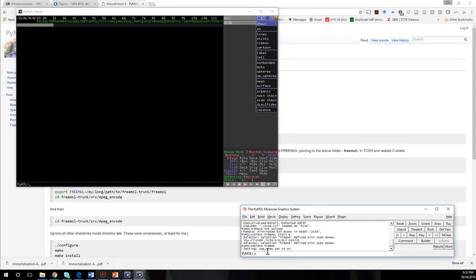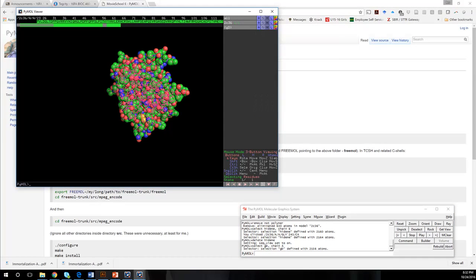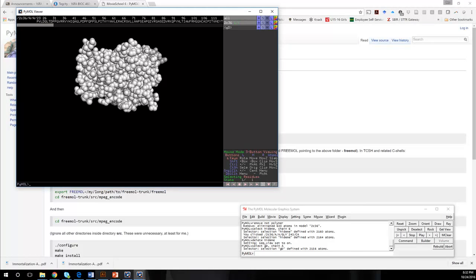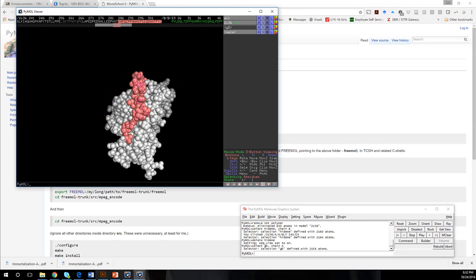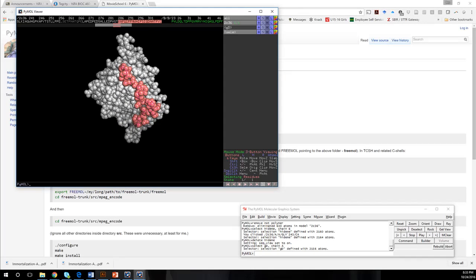You know what I didn't do? This is what I should have done. Okay. Then I will just do this. Okay. Then I will change the color, take off the selection, and then I am going to color about 285 through 306, just so that I have a frame of reference, because that's what I use a lot of. So I'm going to make it deep salmon, and then I know where that's at, and I have a frame of reference to what I'm looking at, because otherwise I struggle a little bit with what I'm looking at all the time. And this might be upside down, but I at least know where I'm at.